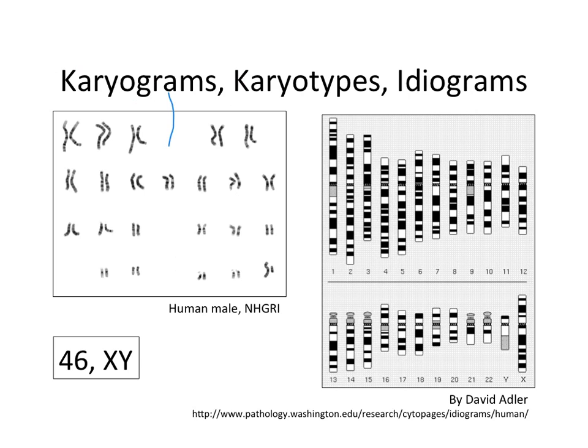And a karyogram is what you call an image where you've taken all of the chromosomes from a metaphase chromosome spread and arranged them so that the two homologous chromosomes are next to each other and in the same orientation. In this human karyogram, for example, you see that we are diploid. We have two copies of every chromosome.